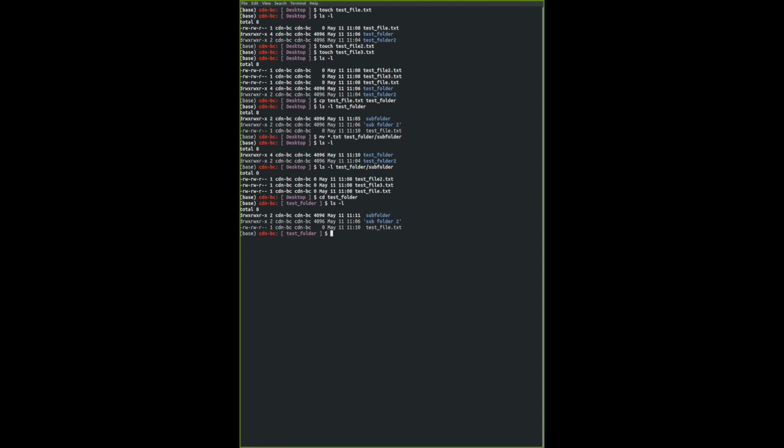This is more like a software, a very small, very handy software to edit things. It's called Nano, and I checked this on Windows. If you followed the instructions that I provided step by step, you should have Nano on Git Bash. So you type nano followed by the name of that file.